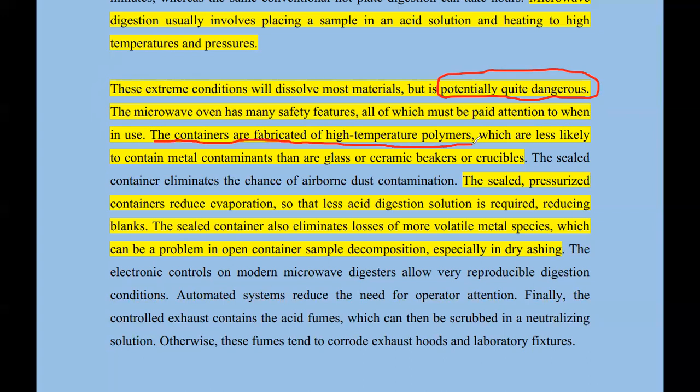Yeah, because metals and the acids, metals might dissolve. So make sure that the walls are made in such a way that temperature should not be the factor, as well as the presence of hungry and angry hydrogen ions present in the acid.